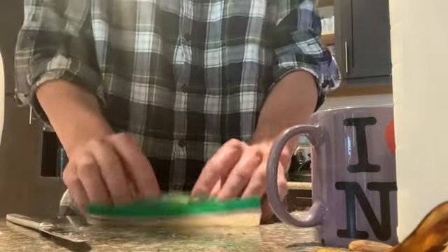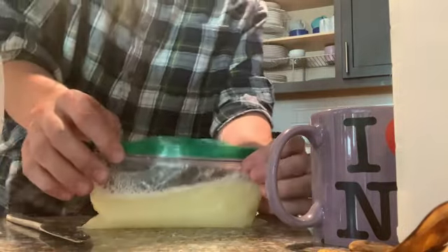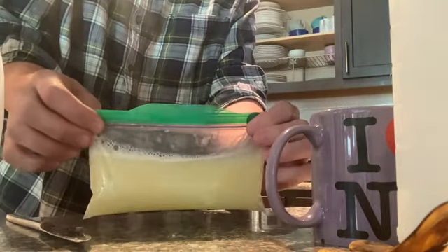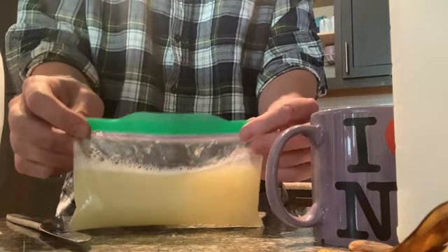Do this for 30 to 45 seconds. It's pretty homogeneous at this point. Pretty opaque. All right, now add the dishwashing soap to the bag and gently mix the contents. Try to avoid making too much foam.